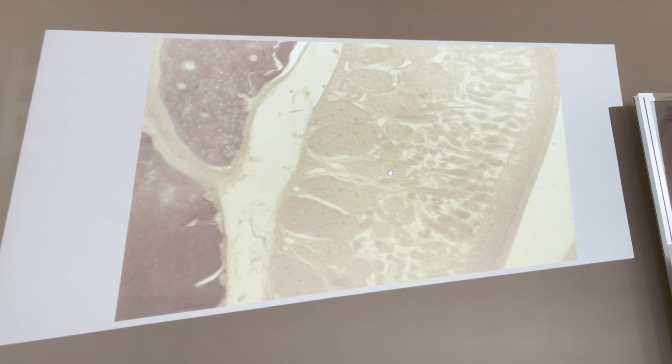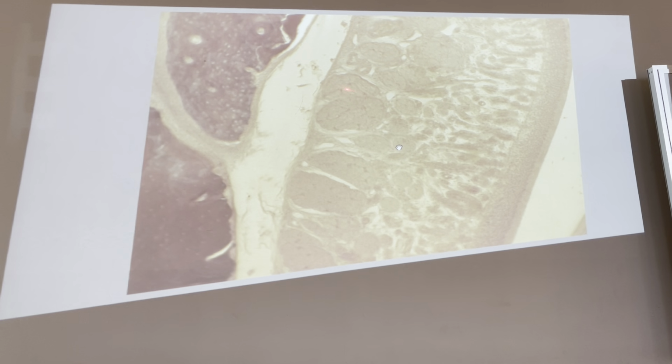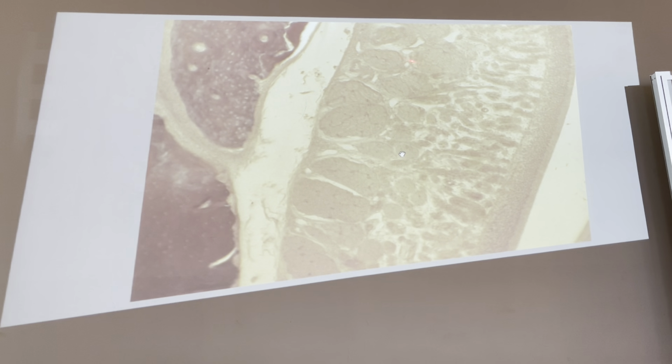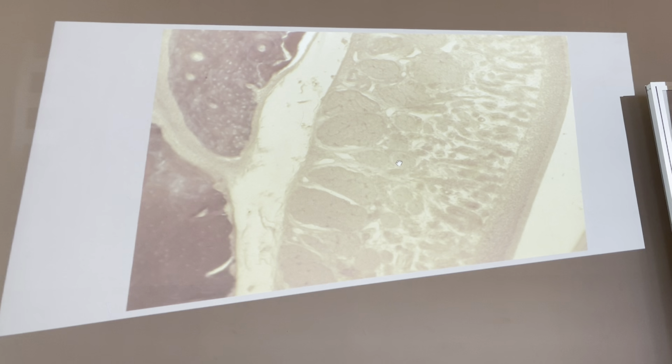Okay, so this is the duct of the Bowman's gland. This is the olfactory nerve. You see the bundle of axons surrounded by myelin sheaths. And also we have a huge amount of blood vessels. Okay, let's proceed to the structure. Let's magnify to see just the cells.